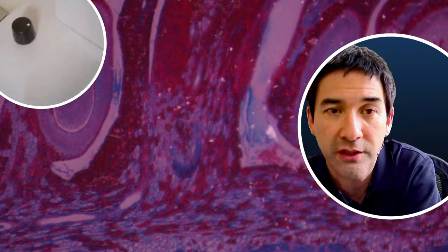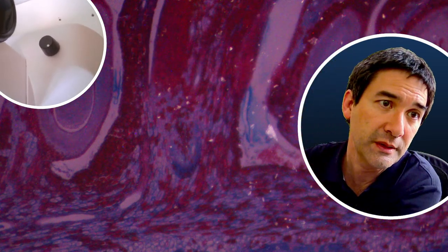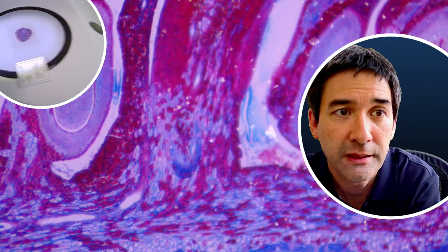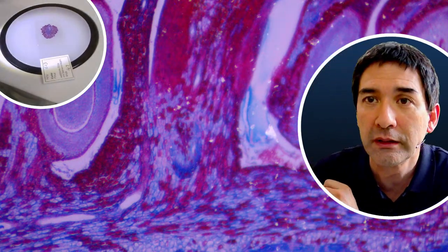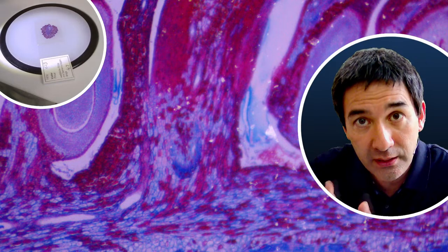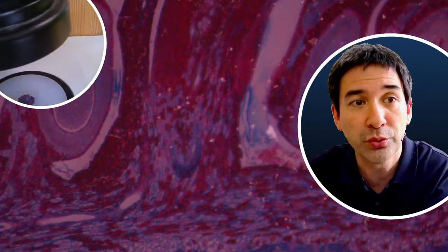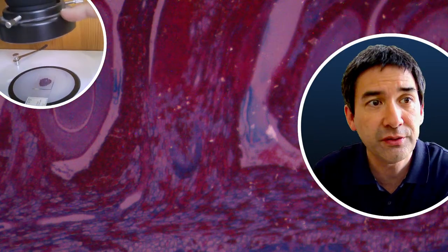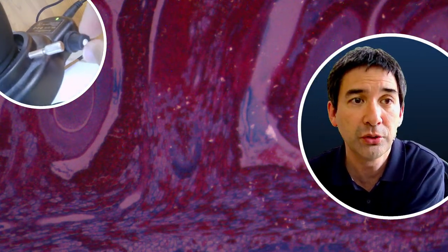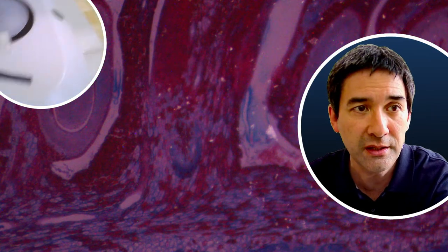I have a third lighting option which the microscope did not come with — I bought it separately. That is a so-called ring light, an LED ring light that you can connect, with a knob on the side to turn up or down the brightness. So I'll be working with three different lighting systems today and experimenting. I would also like to show you the slide using my compound microscope as well.